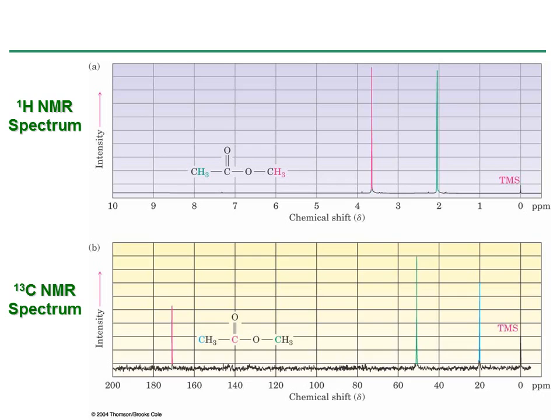And the lower figure gives the C13 NMR spectrum for the same compound, but we see there are two differences from the upper one. At first, the x-axis also measures parts per million and also gives an idea about the chemical shift, but it starts from 0 to 200.